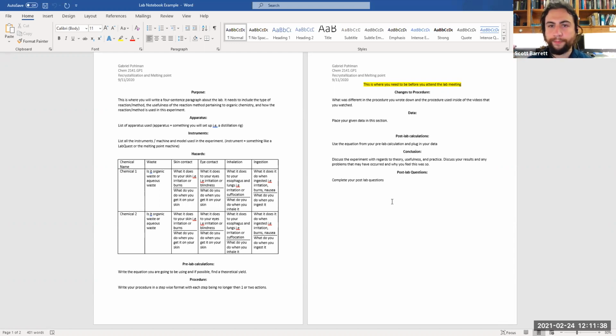It was question number 4, and 90% of you answered it correctly, with regards to putting a hot solution into an ice bath too fast, without letting it go to room temp first. It was correct that the recrystallization would mess up because you can have impurity fall out. But also, if you have a hot piece of glassware with hot solution in it, and you dunk it into an ice water bath, the glass can shatter. It's kind of a rudimentary thing, and I'm counting points off of this just so that y'all understand it.